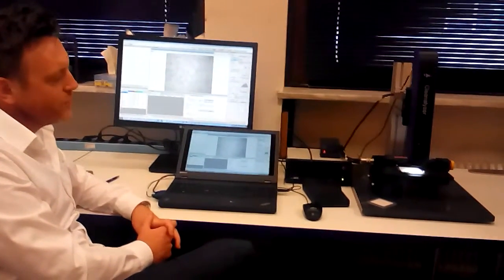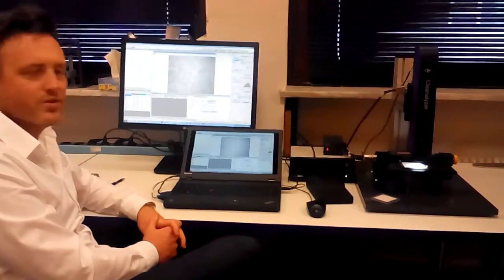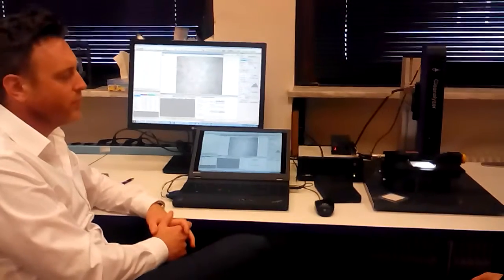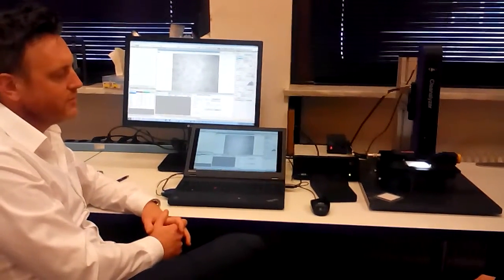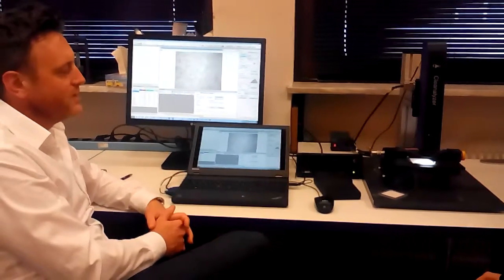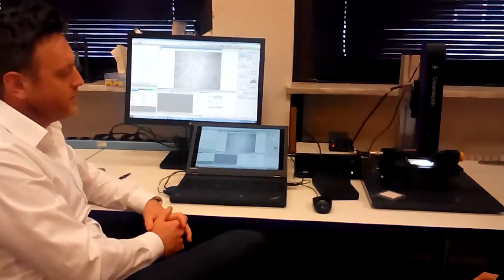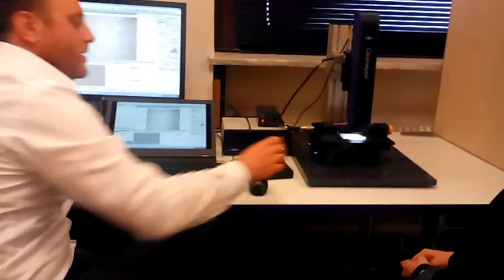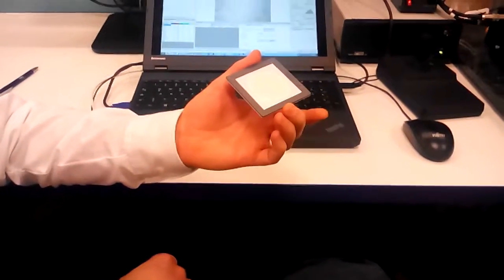So this is an instrument which is designed for analysing residual dirt on metallic parts, all kinds of automotive parts, small components that are integrated into engines and other mechanical devices. The purpose of the Cleanalyser system is to analyse residual particles which are deposited onto filter papers after calibrated washing procedures.